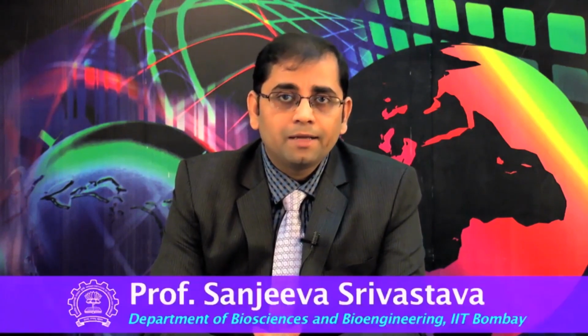In conclusion, we hope that this lecture and the series of 5 lectures so far has helped you to appreciate the importance of sample preparation for mass spectrometry based identification of peptides, the need for enrichment of post translationally modified forms of peptide prior to MS analysis. The lecture has also provided you a glimpse of how impurities in the sample can lead to errors during the identification of peptides, and additionally you were introduced to the concepts of PSMs and how a specific software like SpectrumMill uses PSMs to score the hits. Lastly, you were explained the concepts of phosphosite localization and scoring using suitable examples.